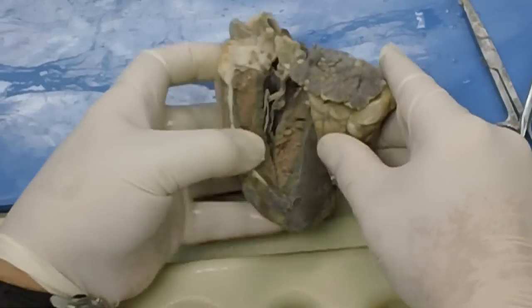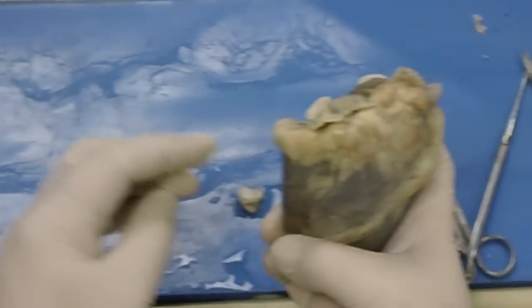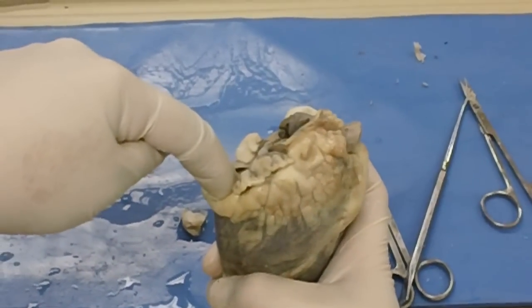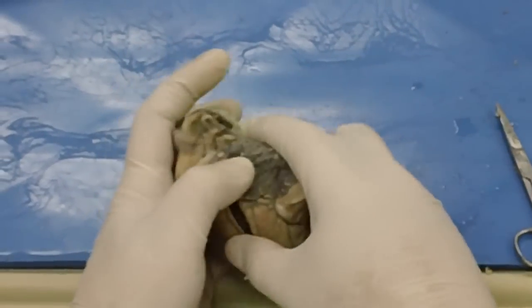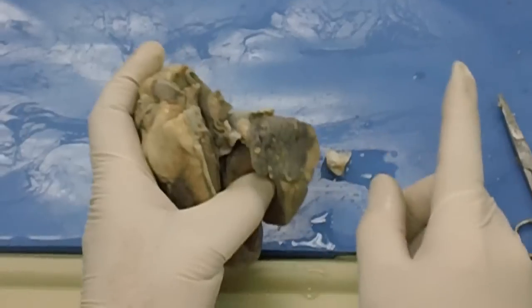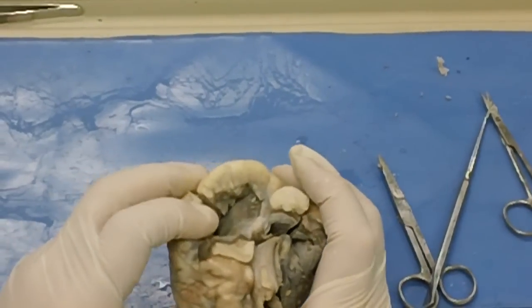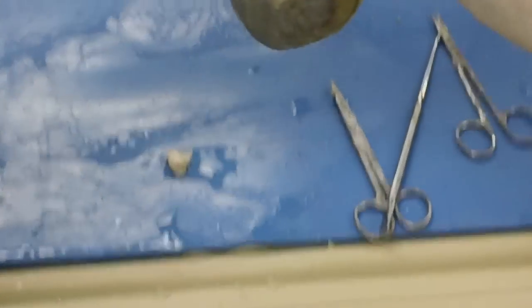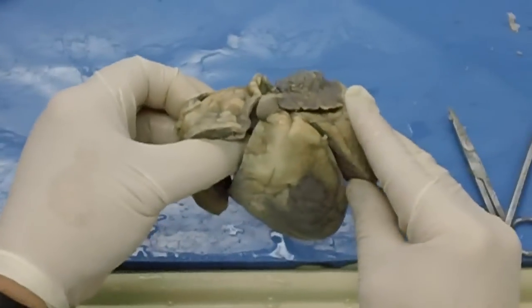So it's kind of a V-shaped direction of blood flow on both sides. Comes in, right atrium, shoots out the pulmonary artery. Comes in, left atrium, shoots straight up into the aorta. So that's the way a heart's dissected, so you can see all the different parts. Does that make sense? Yeah. Okay.